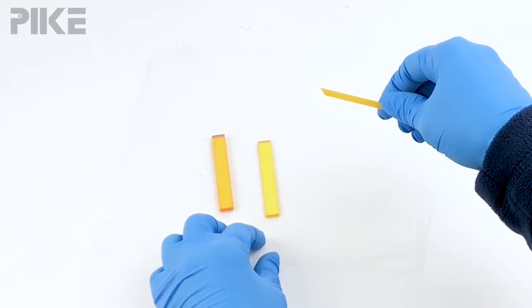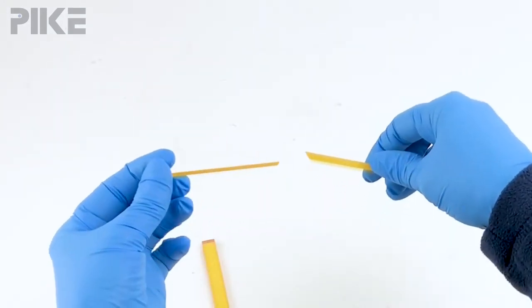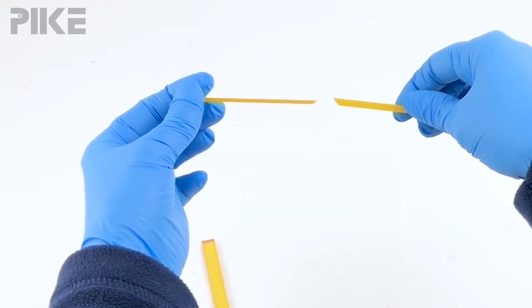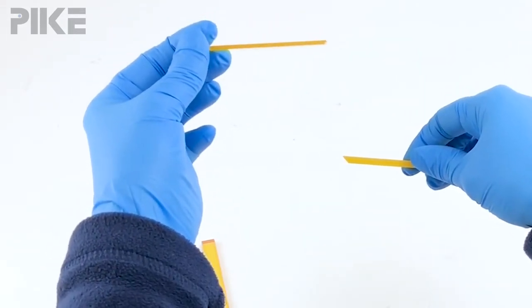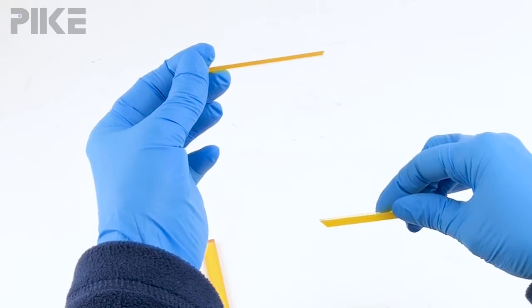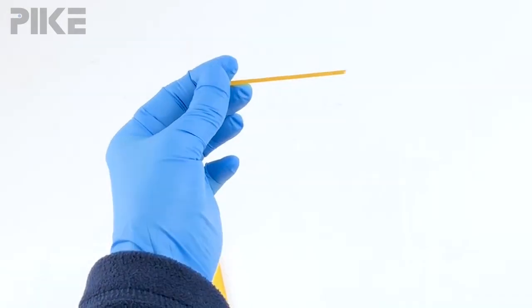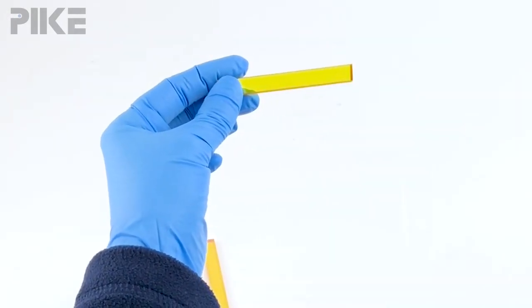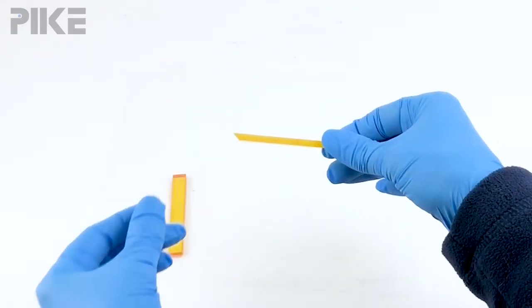We have a four millimeter thick, that's most common, and then we have a two millimeter thick. If you have a thin crystal, this face angle is 45 degrees and the number of reflections on the sample would be 20.